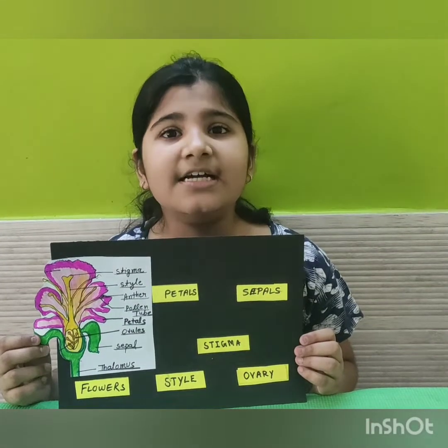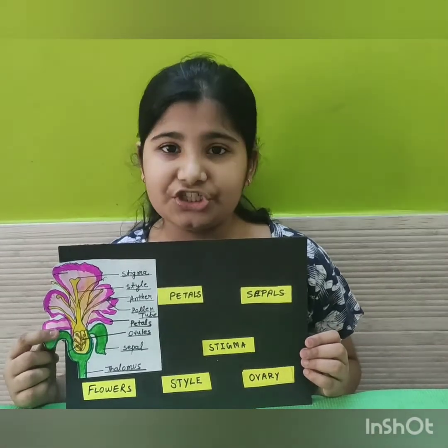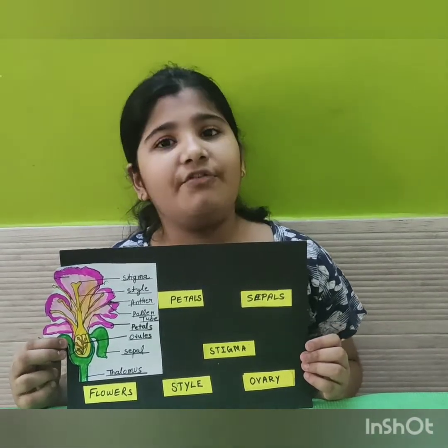Hello everyone. This is a demonstration video of the dissection of a Hibiscus flower.